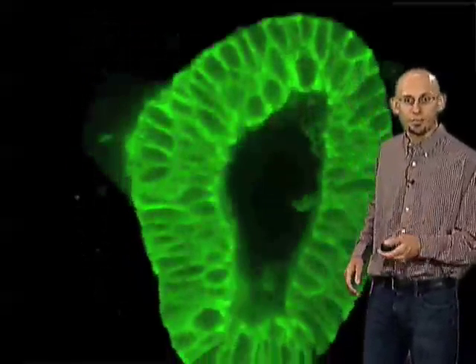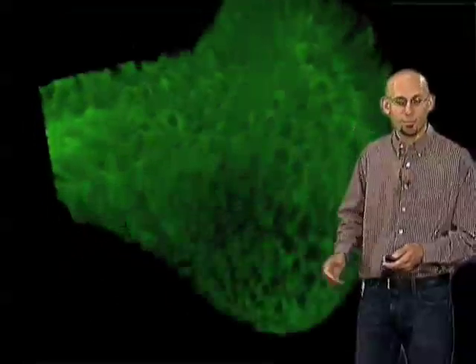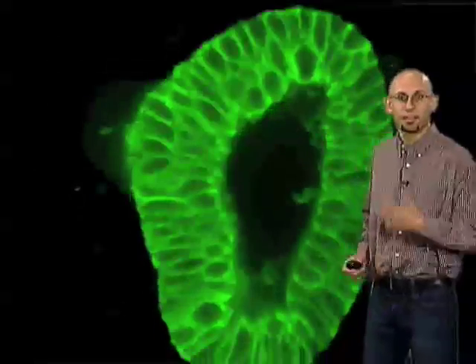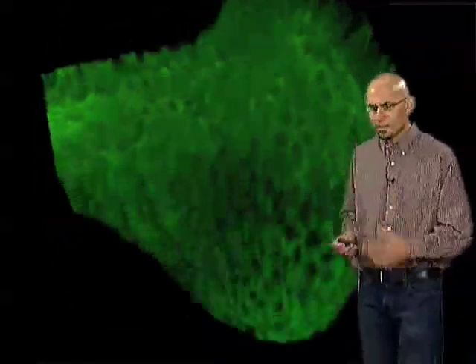Here's another example, which is a high-resolution view of that same mouse lung I showed you in the beginning. And here we're just looking at one little chunk of it. You can see, again, in this 3D rotation, the internals of it. You can see individual cells here. All these lines here are the cell membranes of different cells in this lung. So just to see that again, you can get this really nice three-dimensional reconstruction of this image at very high resolution and very high detail. And that's sort of the point of confocal microscopy.